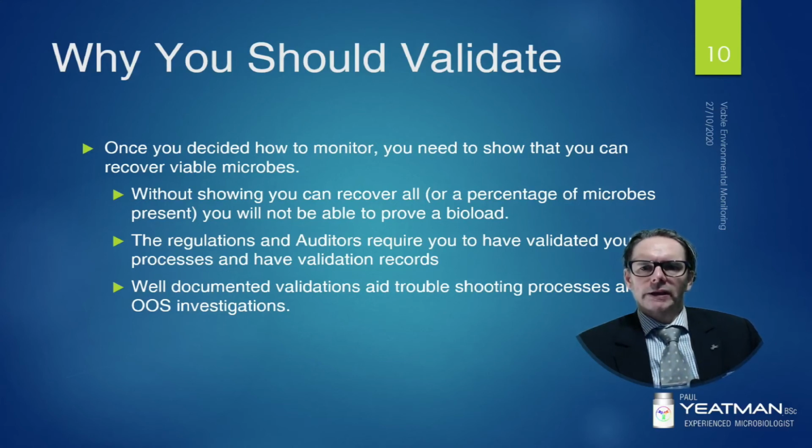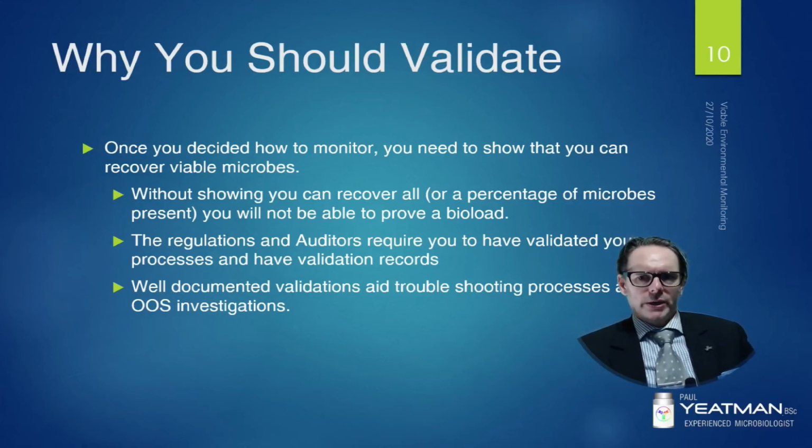So if one colony forming unit was recovered from a swab, does this represent a single microbe was picked up on the swab, or were there 20? Without validation, this is a mystery. And mysteries in manufacturing are never good. You don't want any mystery in your own processes.